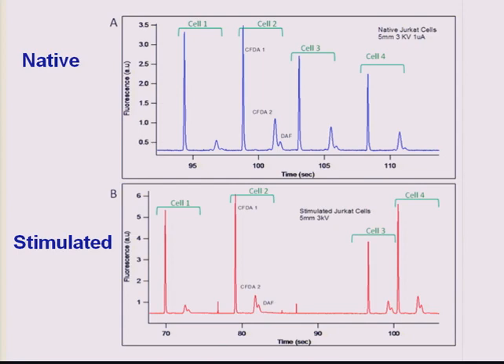So you can see here, when we were doing the bulk cell lysis, we actually converted all of the CFDA, due to the base hydrolysis, all the acetate groups were gone. But here you actually have a monoacetate that's still in the cell because we lysed it here in physiological pH buffer. So here we actually have two basically internal standards.